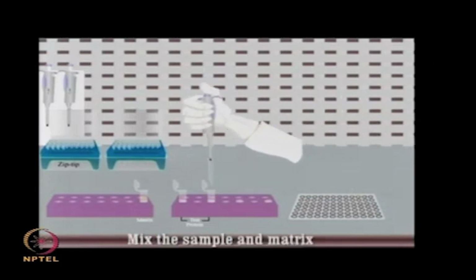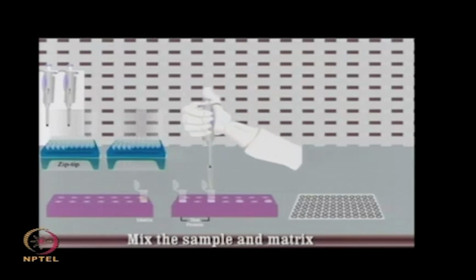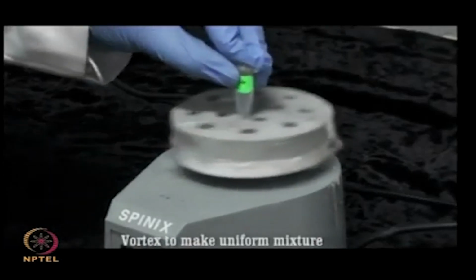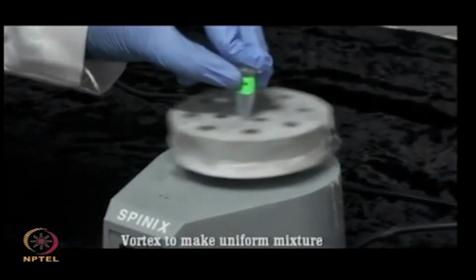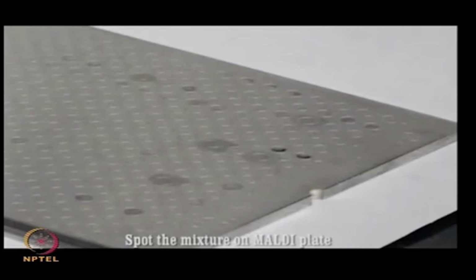MALDI is performed in two steps. In the first step, the compound for the analysis should be dissolved in a solvent containing small organic molecules known as matrix. This mixture is dried before analysis and the liquid solvent used in the preparation of the solution is removed. So, in this video, by depicting the matrix preparation as well as instrumentation, we will try to give you an overview of the MALDI-TOF instrumentation.